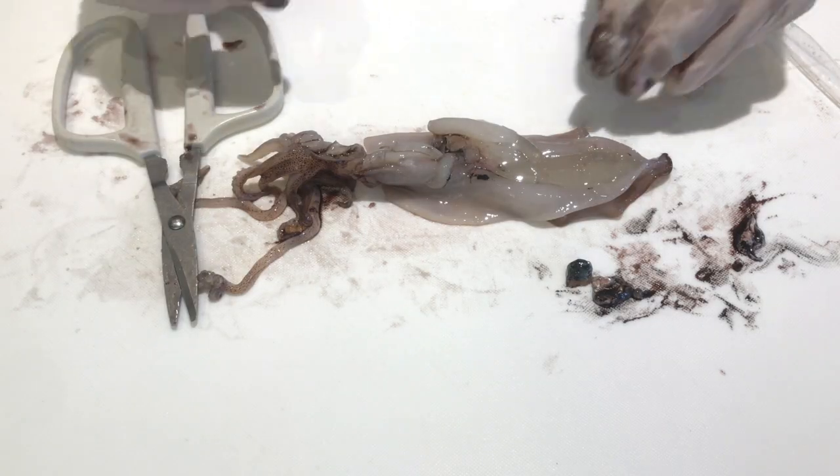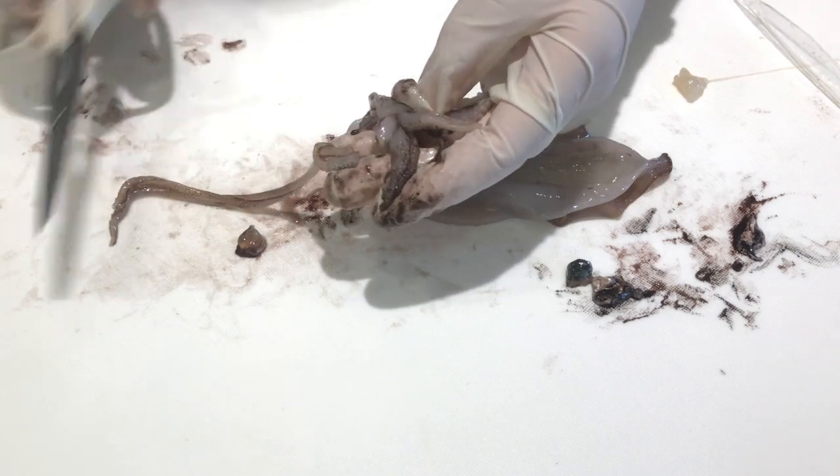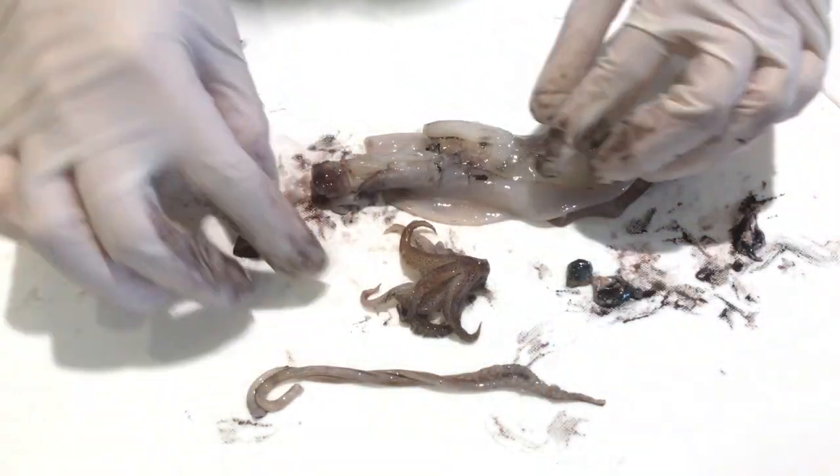Finally, I cut the appendages of the squid, which include the tentacles, the arms, and the sucker cups. The tentacles are the long, thin structures that I cut first. I cut the arms and the sucker cups next.